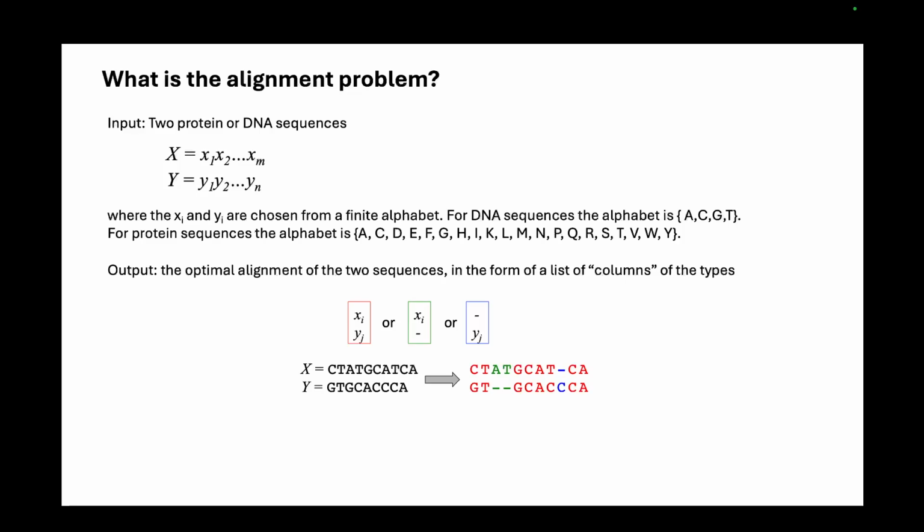In the first part of the lecture we talked about different types of sequences. Then we talked about how, after we generate the reads, we do different types of pre-processing like removing adapters and checking the quality of the bases. After that, the step that comes next is sequence alignment. After we have cleaned all our reads, we want to find where each read originated from, and whether this read varies in some way compared to the reference genome, so that we can make certain inferences from it.